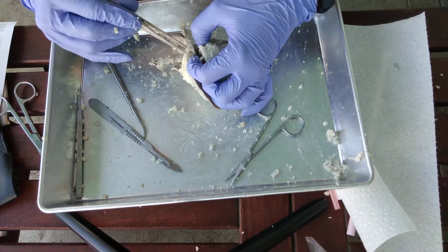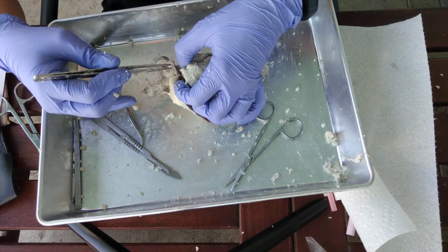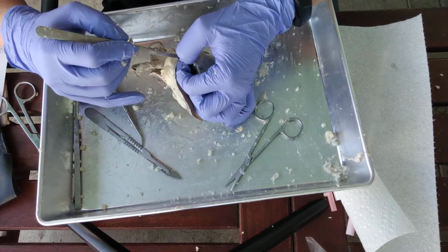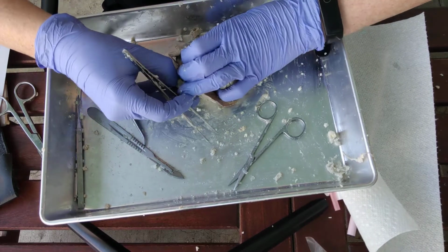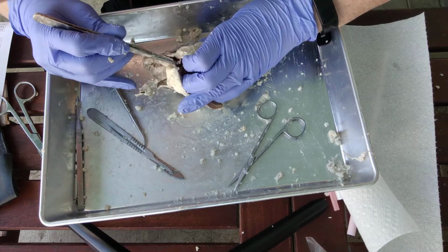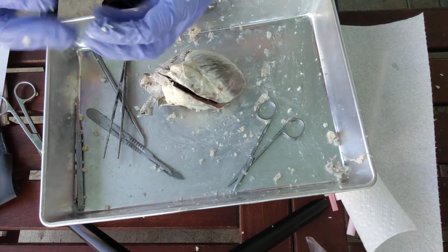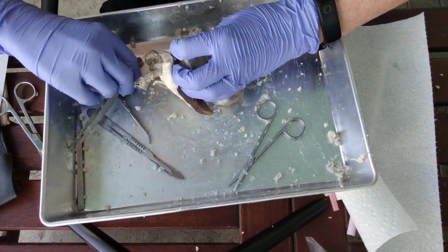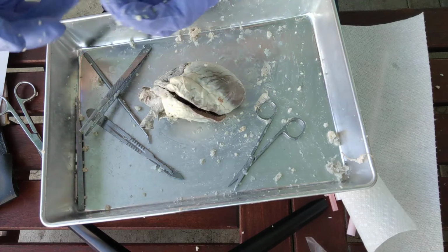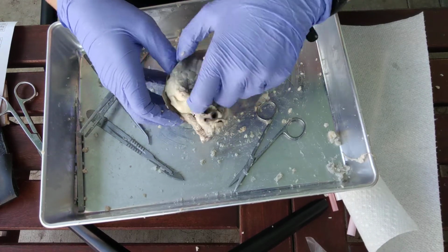Okay, good. See this little flap right here? We're looking just at the boundary between the pulmonary trunk and the right ventricle, and we're going to see a little pouch. See this little pouch right here? When the blood tries to flow back into the ventricle, that little pouch is going to fill up with blood, and that's what closes the valve. So you're going to look for these little tiny white cusps, little flaps, and those will be the pulmonary valve. They're very small.